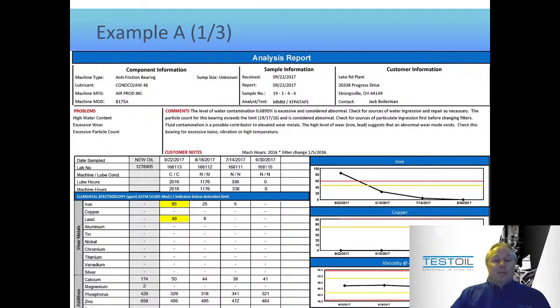So as you keep reading the report, you're going to move down to the next section where it lists all the problems. So that's just a list of the problems, but to the right of it are the comments. And you're going to find a comment for every one of those problems. Now again, being fair, those comments are a little bit middle of the road. They are pre-written, so they are a standardized format, the spelling's correct and all that kind of good stuff. But they are actually hand-selected through human eye revision of your report.